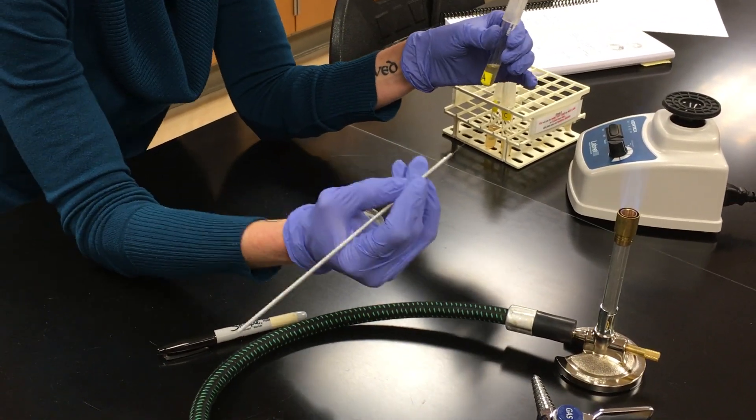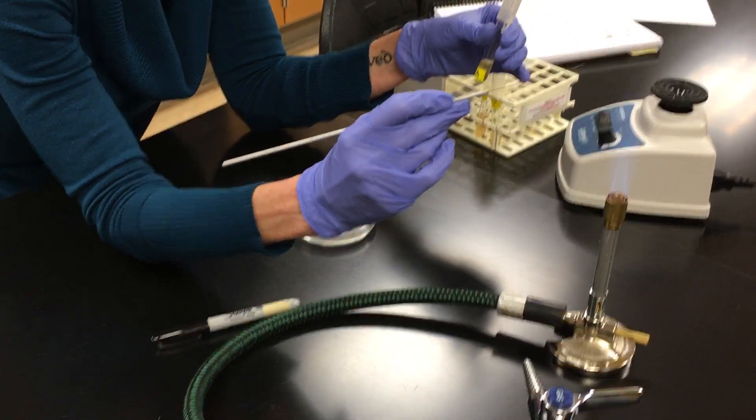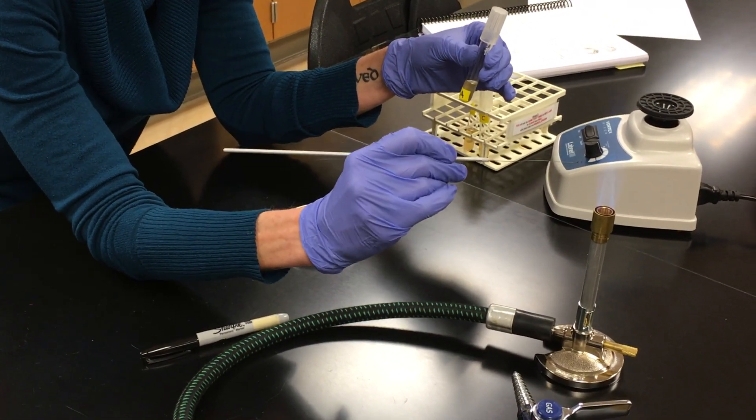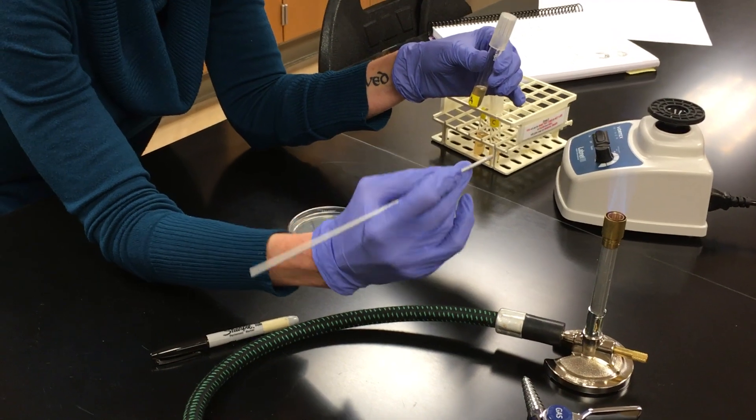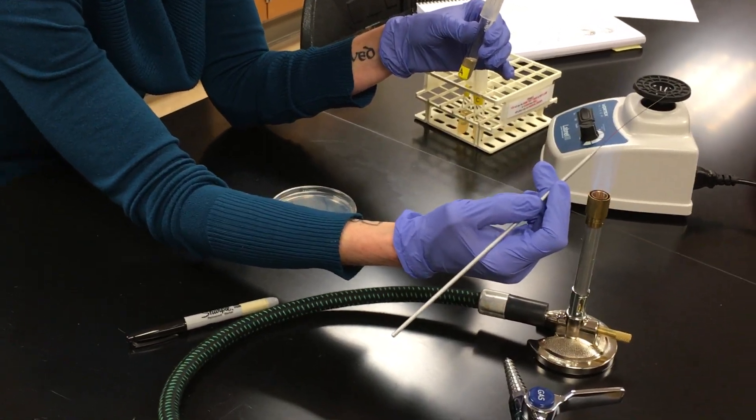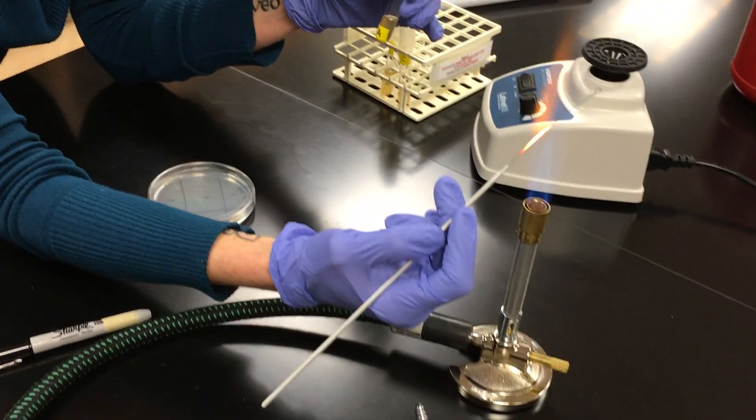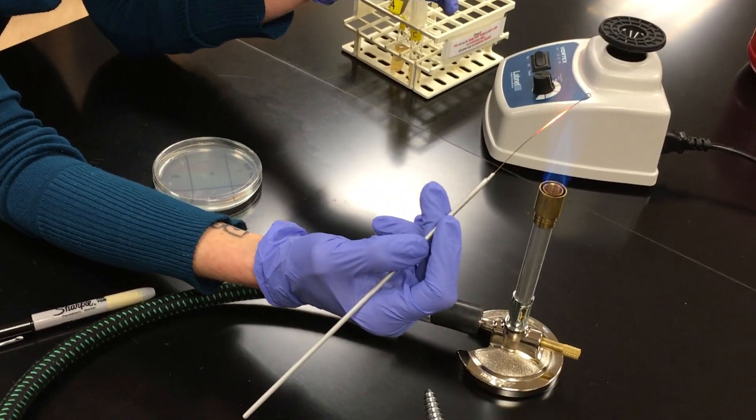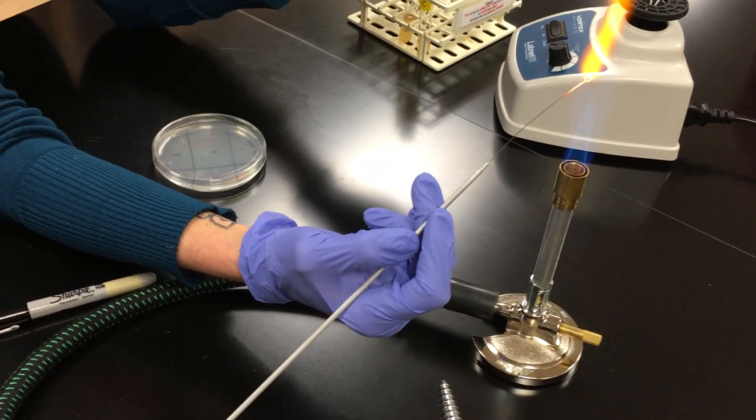We've got our loop. We're going to flame our loop. I have my nice tight cone, my blue cone in the center. That's the hottest part of the flame. You're going to start flaming your loop at the base. And so as it glows hot, and then you're going to work your way down to the end of the loop until the loop turns orange.